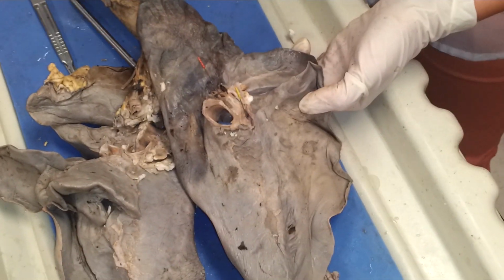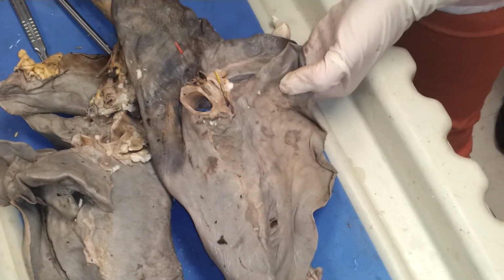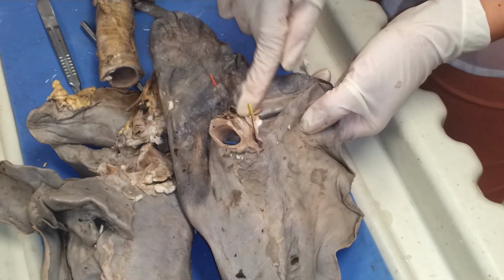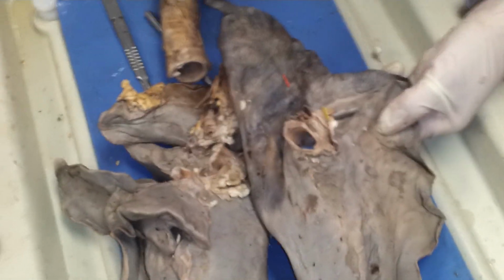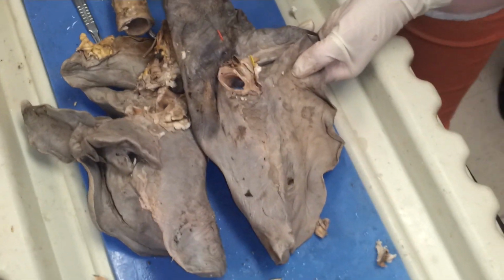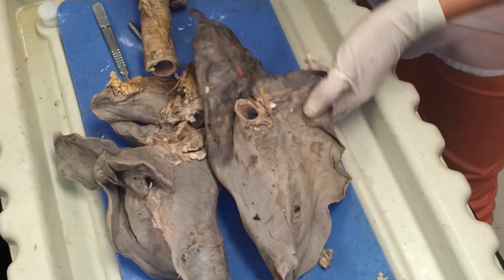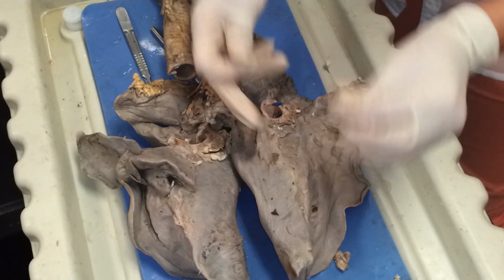How do you know superior and inferior? Where the trachea is at. Well, I mean, now the trachea is gone. But yeah, so where the trachea was, the artery is superior. So the pulmonary artery will be superior to the primary bronchus. And then the pulmonary vein usually is inferior to the primary bronchus. Okay? Good. I can leave those. No, I'll take them out for now.